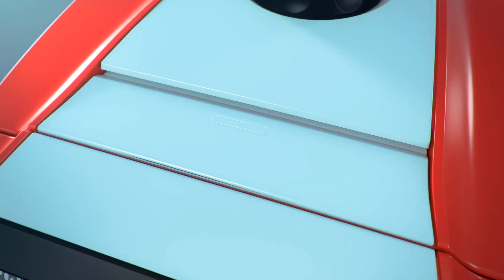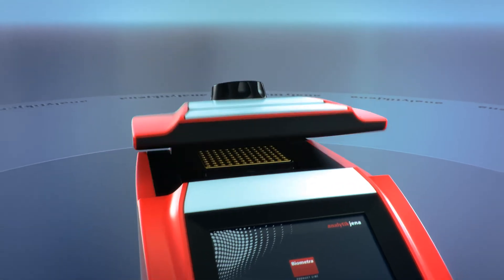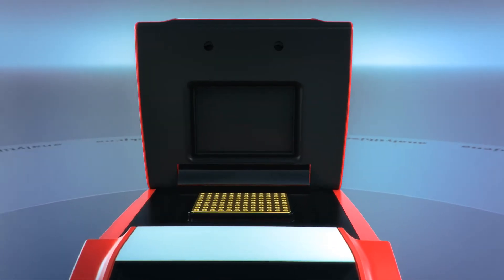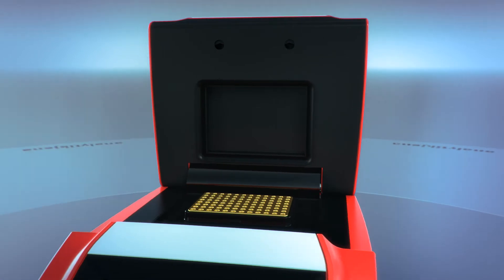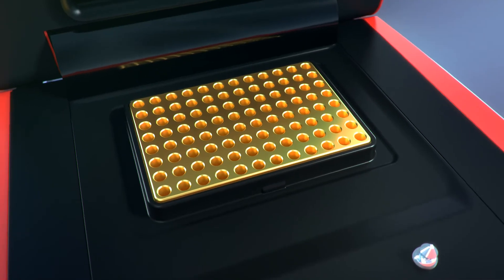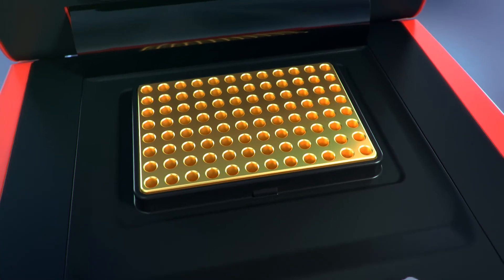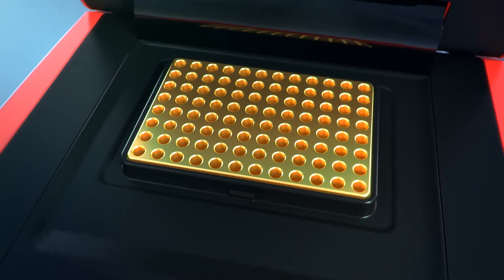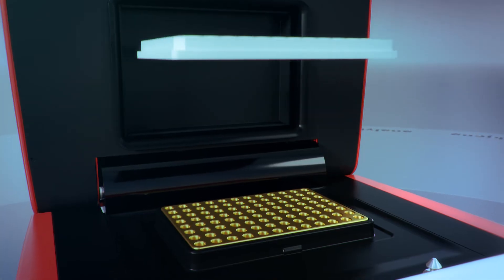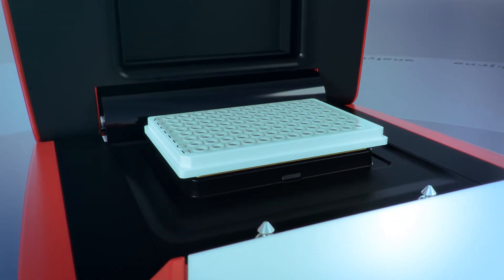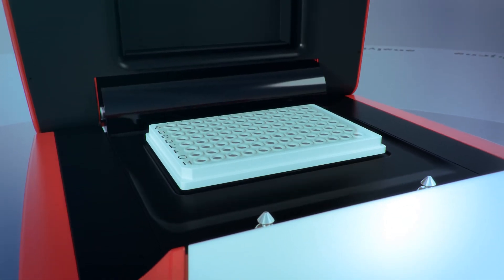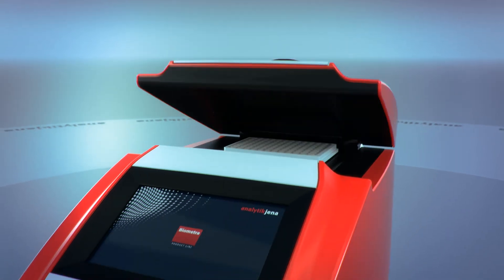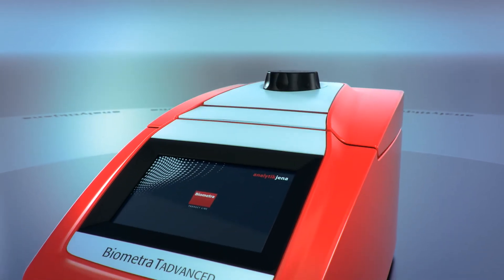The lid automatically swings open at a gentle finger press of the lid open button and becomes locked in its final position by the integrated spring mechanism. The lid cannot drop down at the 90 degrees opening angle, providing easy access to the sample block for inserting PCR tubes or plates.